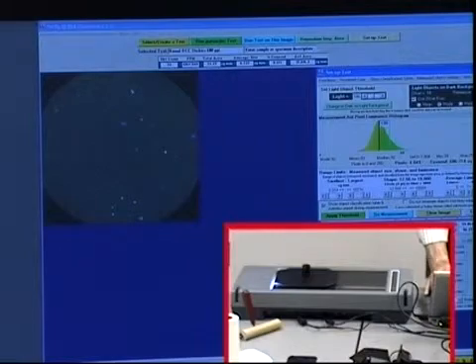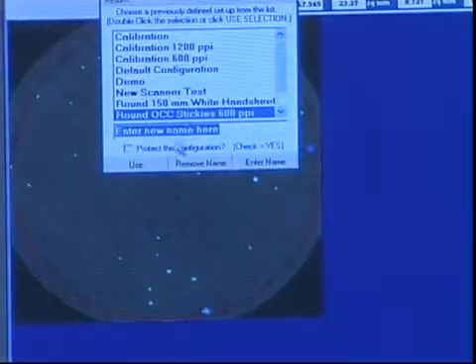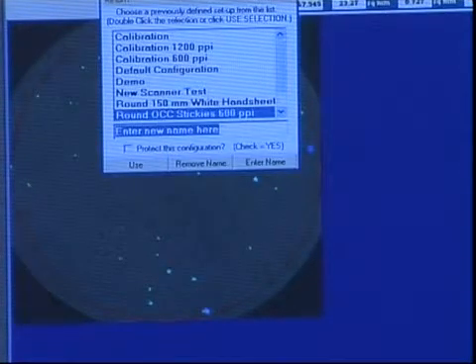And it's all done. Now you see there the stickies, the quantified stickies. A very simple test. I will turn off the setup mode altogether. And as you can see, in the lineup of tests that are available, this is the round OCC stickies. This is the white one we ran previously. And we have selected the right one to run automatically.